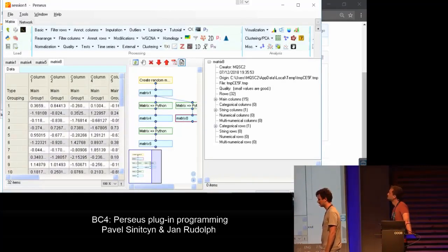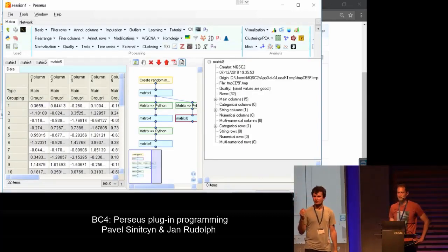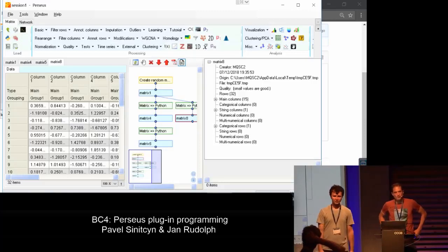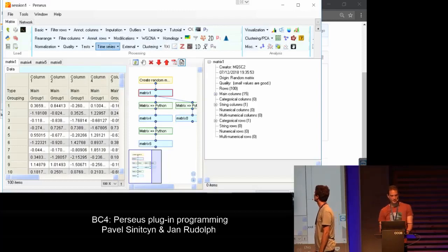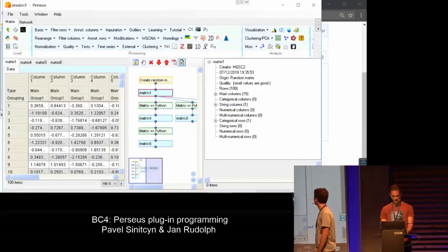Okay, I think one more thing, like error handling. But I think it's better to make it, otherwise I should repeat it. If you usually use Python over the command line, you can just have the space in between. Why do you have the equal now? Does that matter at all? I don't think it matters. It's just a personal taste. I think you can even have space equal space and then the number. When I say number of rows, I can just say 11. Cool, so that also works.